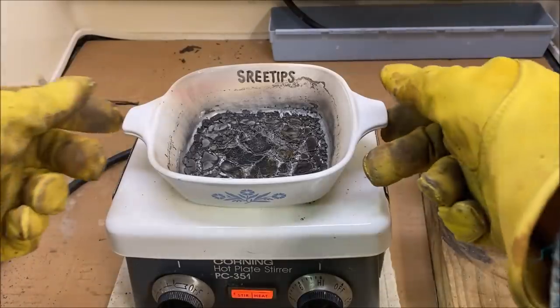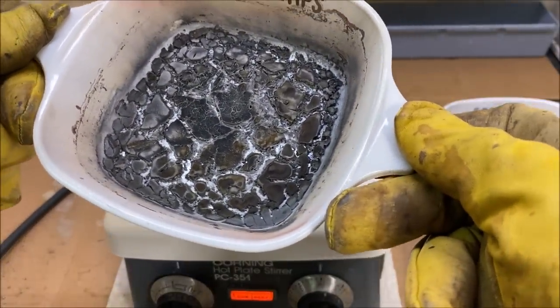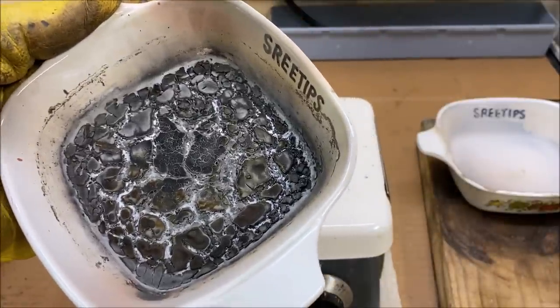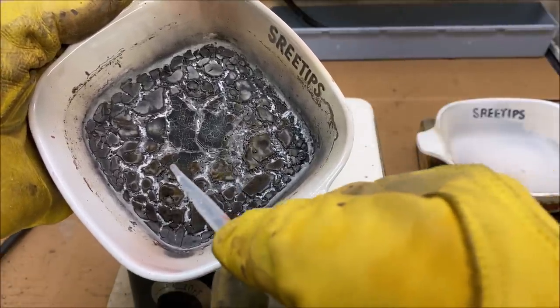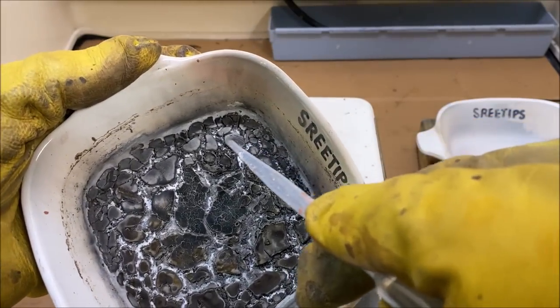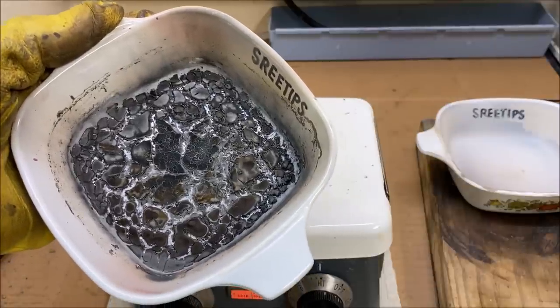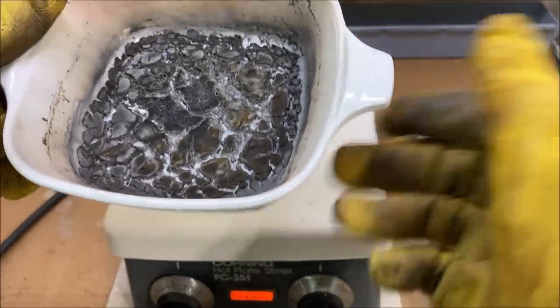If you look at our material in here, still got some spots that are kind of discolored. If you look down in here, here and here, and what I'm after is something that looks like that nice gray piece right there. This is platinum metal. I'm trying to get it all properly burnt so that we can go to the next step.